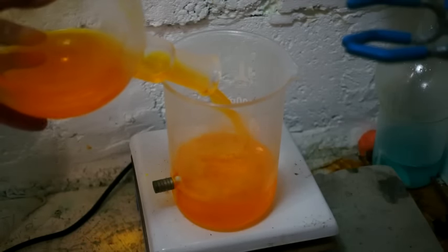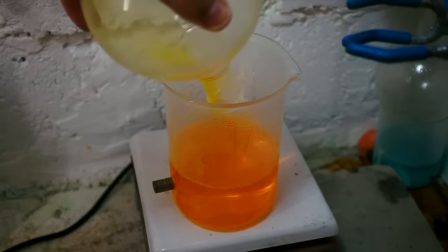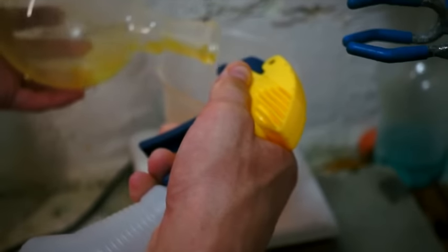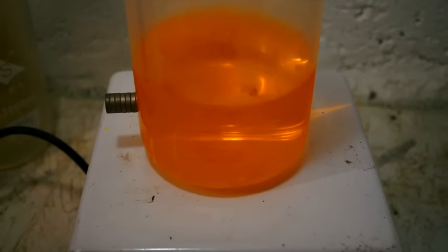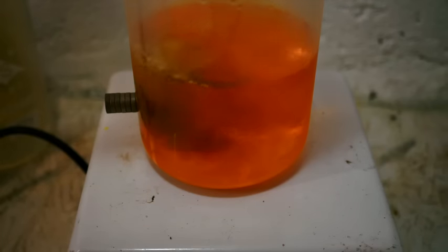You can see the lead that fell out of solution stuck in the filter. Now we will transfer the solution back to a large beaker. Be sure to rinse your flask completely. We will now add a saturated solution of sodium metabisulfite in order to precipitate the gold out of solution as a fine metallic powder.